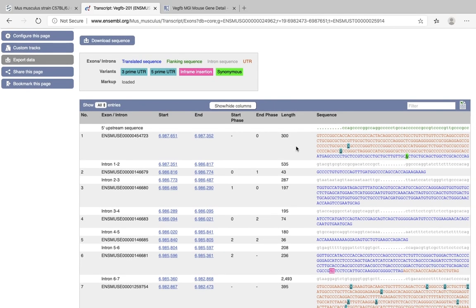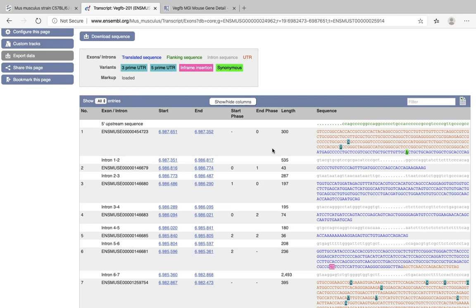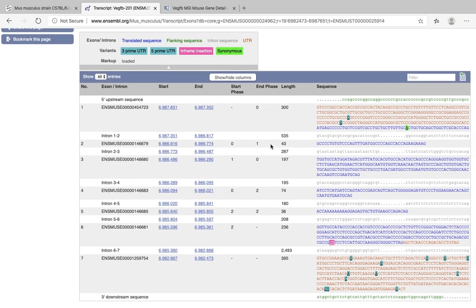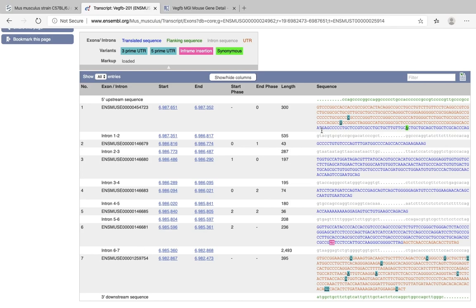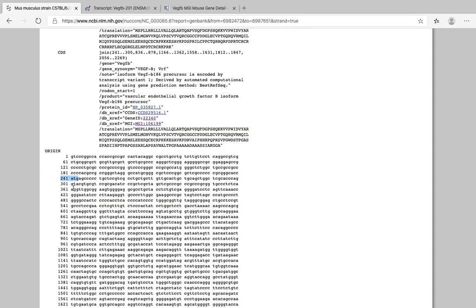What we are looking for is the translated sequence, and the translation of this gene starts with ATG, as we have seen on the NCBI website. Now let's cross-check it with NCBI. Here in Ensembl it is ATG AG followed by five C's. Going back to NCBI - ATG AG and one, two, three, four, five - yes, five C's. So this means that our sequence of this gene is correct, and now we can move to the next step of designing our sgRNA.